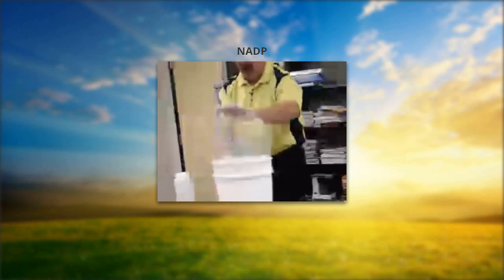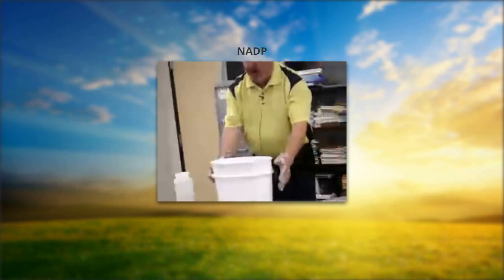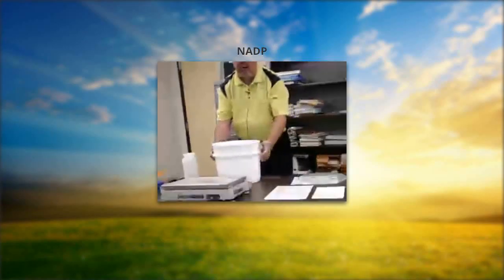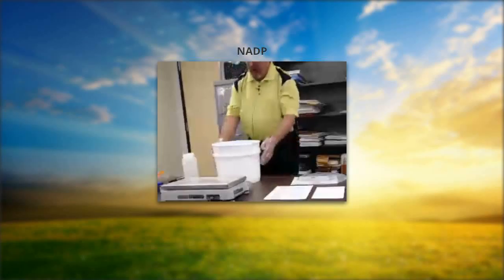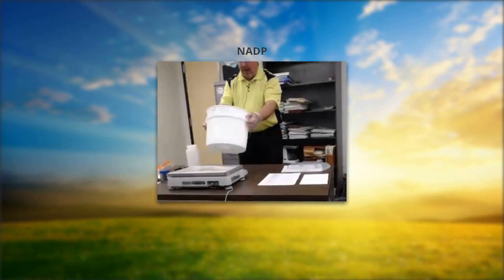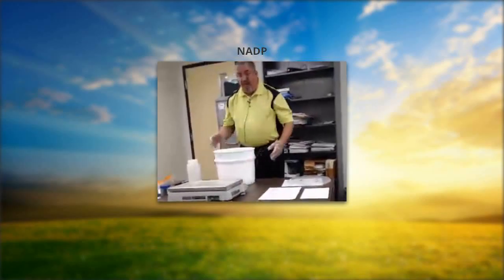Pull it towards you and set it aside. After the lid is off, do a visual inspection. Never put your face over the top of the bucket — turn it ever so slightly towards you, being careful not to slosh the contents, and look for any contamination. If it's floating, let it settle. If you have large debris like leaf matter or dirt particles, let them settle before decanting.